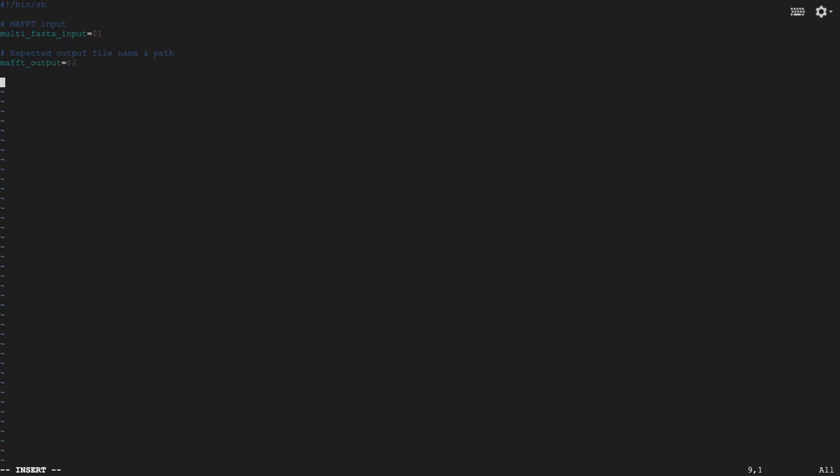Again, following in line with what we did with Ivar, we're going to go ahead and capture the temporary directory name and then change to that directory to ensure that Singularity is run from that temporary directory upon execution of the external app. So let's go ahead and comment this out: change to CLC Genomics Server External Application Temp Directory. Then the temp directory is going to be captured from dirname and that second positional argument from the user. And then we can change to the temp directory and we should be good from there.